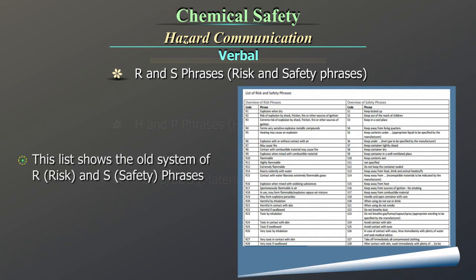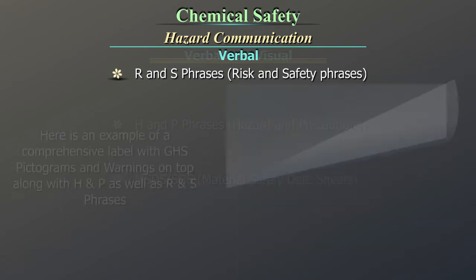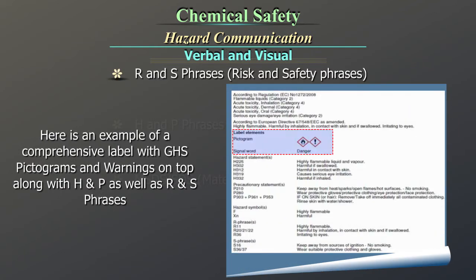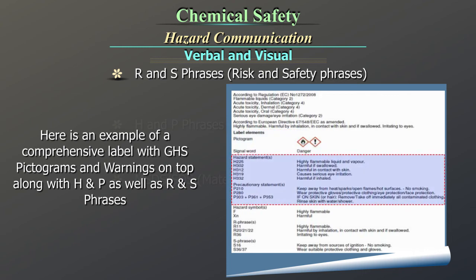R and S phrases — Risk and Safety phrases. This list shows the old system of R (risk) and S (safety) phrases. Here is an example of a comprehensive label with GHS pictograms and warnings on top, along with H and P as well as R and S phrases.